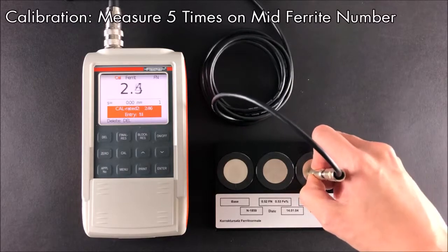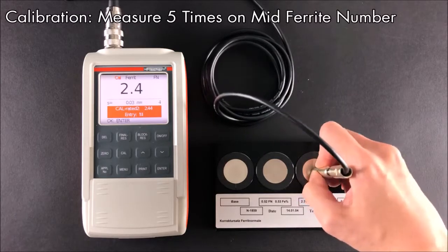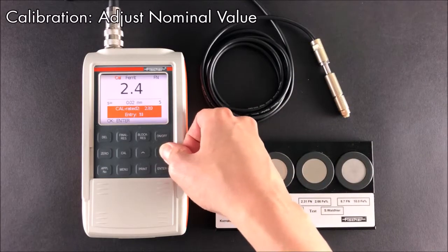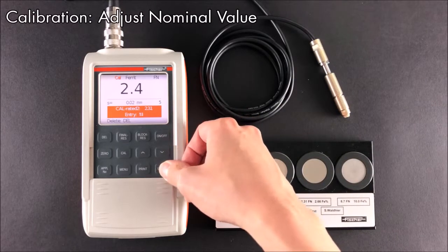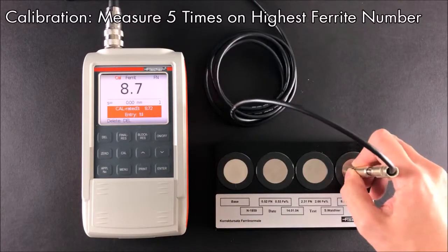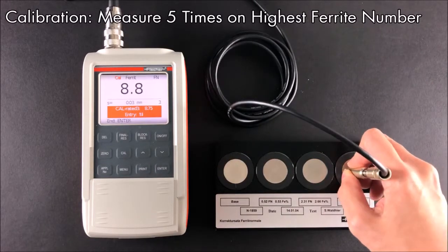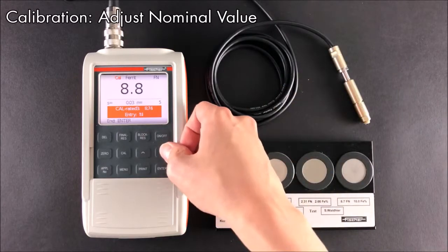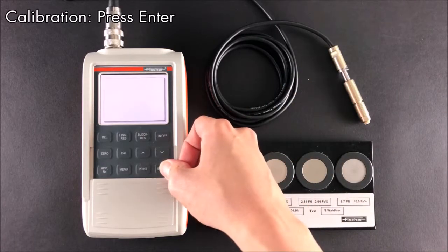Next, repeat the same steps for the remaining calibration standards with increasing ferrite concentration. The calibration is complete.